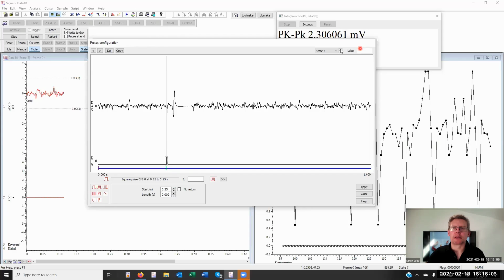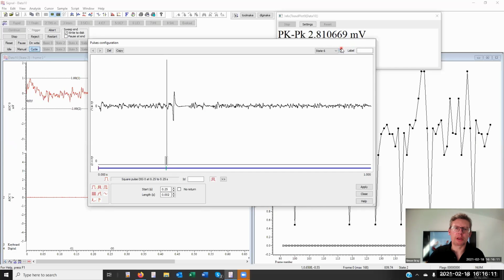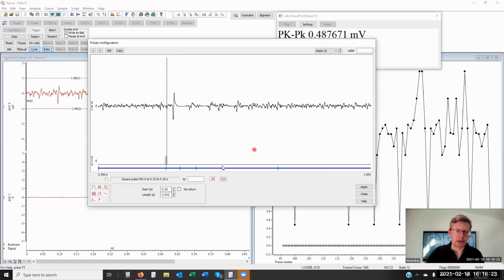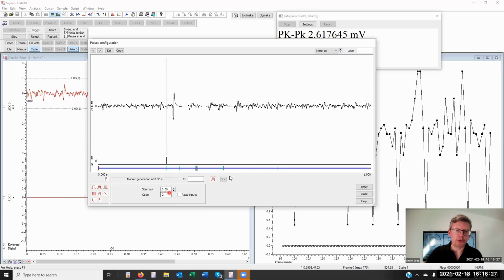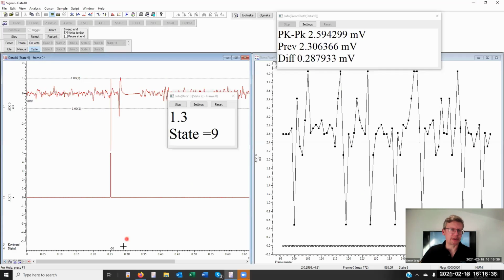Now, as you can see, the states all have different arbitrary waveforms held in them. I've carefully loaded those from an existing data file. Here at state 12, we don't seem to have a response at all. The other markers you see here hold different codes, indicating when different types of stimuli were delivered. I'll use those later for some further analysis.